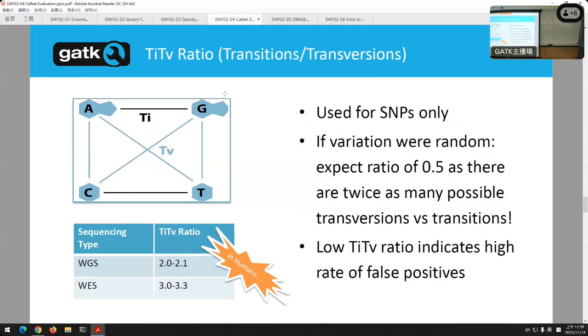So you can calculate that ratio in your call set, and you can say, does my call set match what I expect to see in nature? Or does my call set look like I'm seeing a lot of noise? It's one of those cool metrics where, as has been a theme in many cases, we pull in additional information to better give us context to interpret what we're seeing. And important down there, again, in humans, it differs slightly. We mentioned grabbing the right truth set, right? It differs between looking at the whole genome versus just exomes. You see slightly different numbers there.